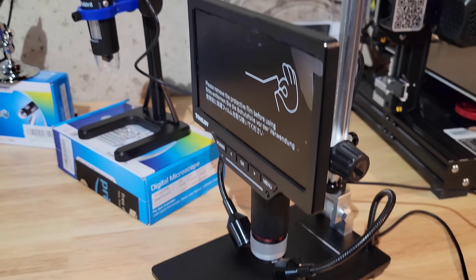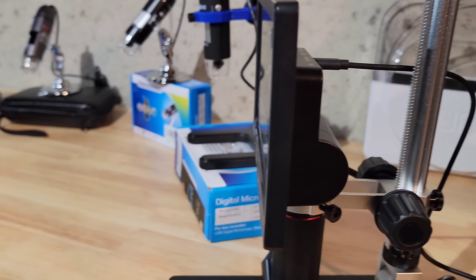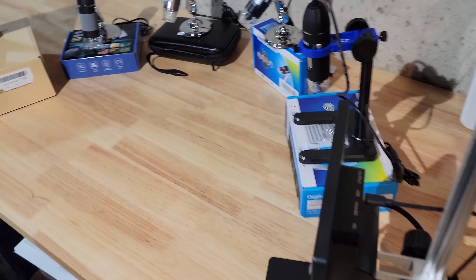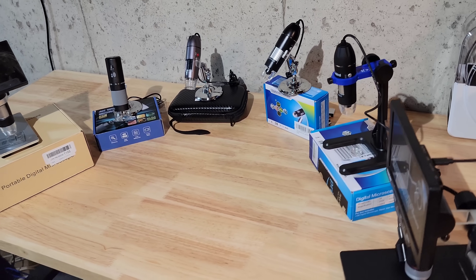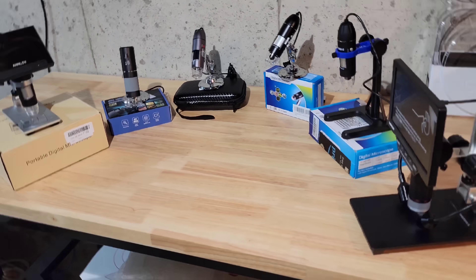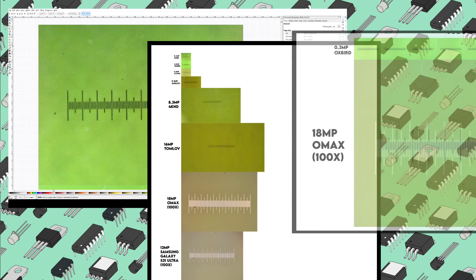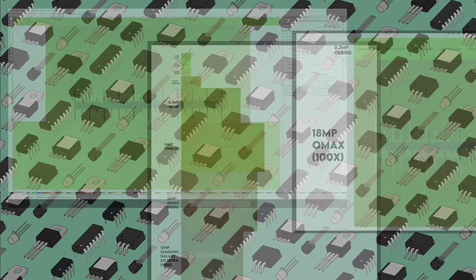I'll go over a brief recap on the previous video before diving in, including going over a few definitions to make sure we're all on the same page. Then I'll be doing a deeper dive on the images that each microscope captured.